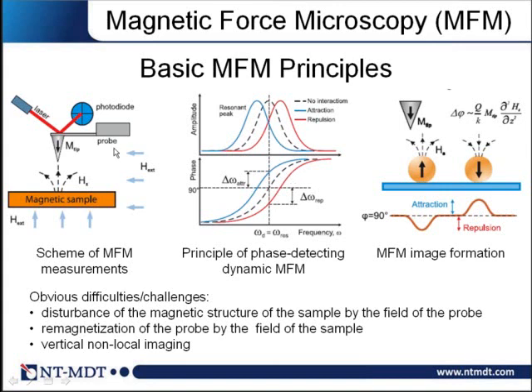I have a question about in-plane magnetized tips. Well, it's also a rather interesting question because, of course, the sensitivity to the magnetic field strongly depends on the magnetization of the probe. And usually, people use vertically magnetized tips because they are just more stable from the shape.